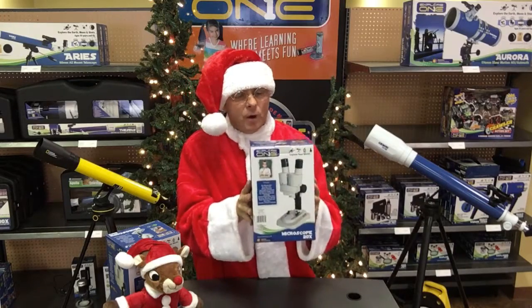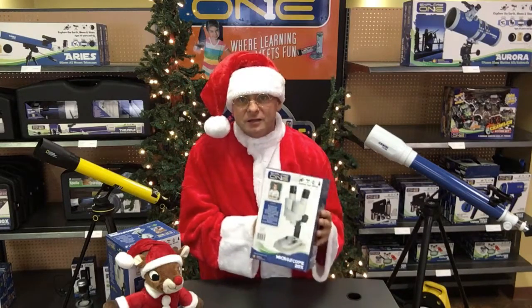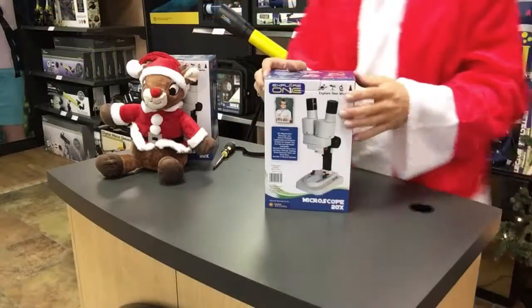So anyways, what we're going to do is we're going to take it out of the box, I'll assemble it and make sure that you know how it works. So here we go.